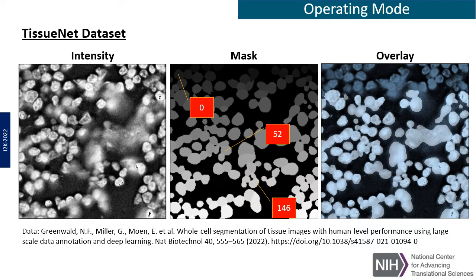A closer look into the cytometry task performed. We need to run a large number of intensity, shape, neighborhood, etc. measurements of an intensity image within corresponding segmentation masks using the second image. The overlay shows a non-trivial intensity distribution within regions, each having its own color.